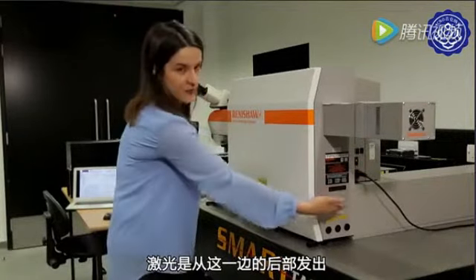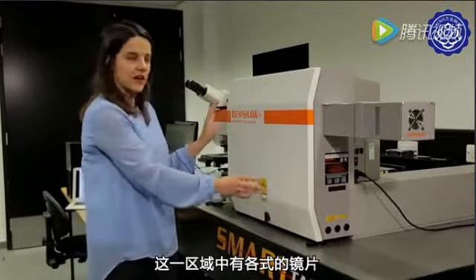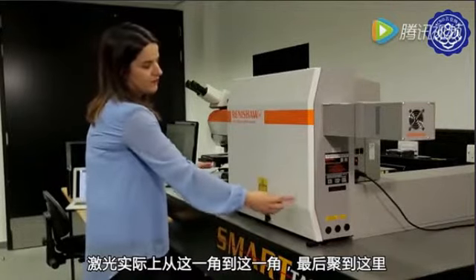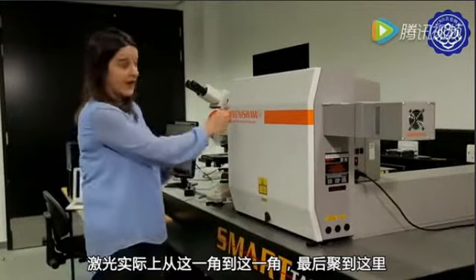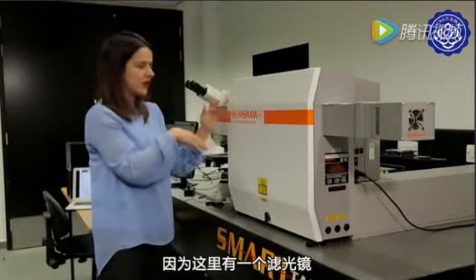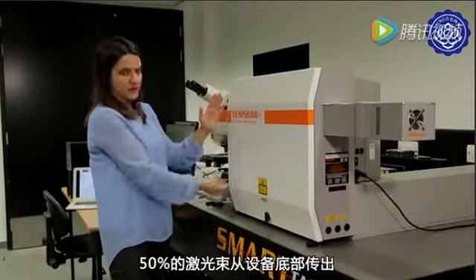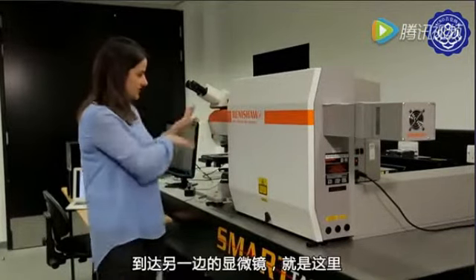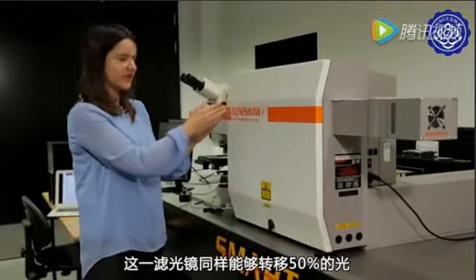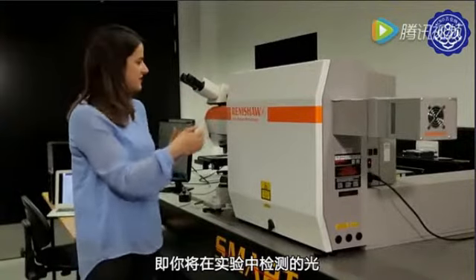Your laser is coming from the back, from this side, and then here you have different pieces of optics. The laser gets scattered from this corner to this corner, and then up here. This is a very important area of the spectrometer, because here you have basically a filter. 50% of the laser beam that is coming from the bottom gets sent to the microscope, which is this other side here. But this filter is also able to transmit 50% of the light, which is the light that you will detect in a Raman scattering experiment.